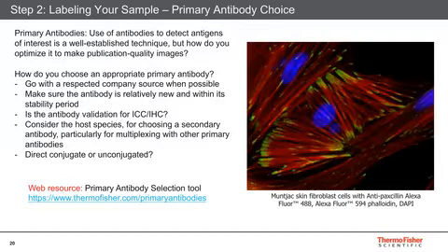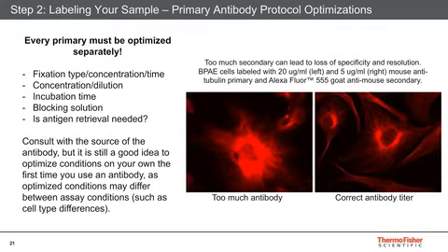Here's a web resource listed here where you can find an antibody selection tool on our websites. Be aware also that we will also be providing a PDF of this presentation, and you can go to that PDF to find these URLs and our resources that I'm recommending.